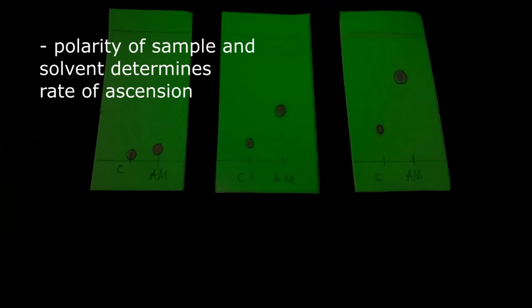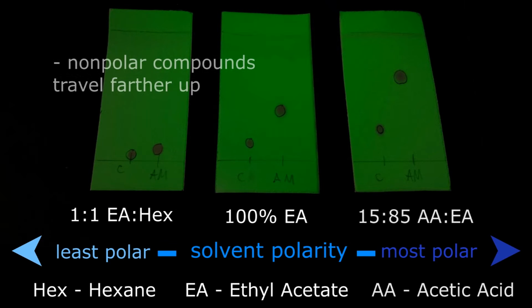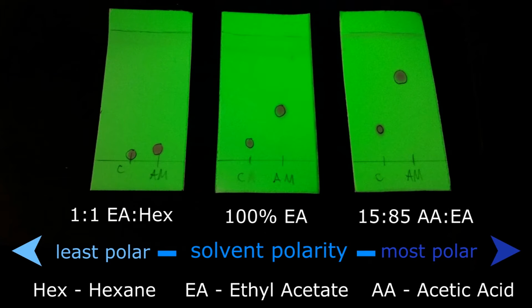During this process, the polarity of the sample and solvent will determine the rate at which the sample is carried up the plate by the ascending solvent. In general, nonpolar compounds travel farther up the plate compared to polar compounds because polar compounds tend to adhere to the stationary phase more strongly.